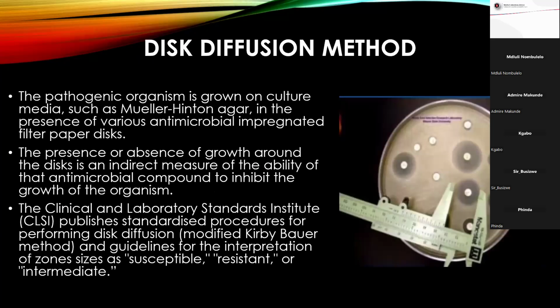So the disk diffusion is usually the most standardized way. Remember, when you are doing AST, there are some standards or guidelines which you follow. These guidelines are usually updated on a yearly basis, so those are the ones which you need to follow.